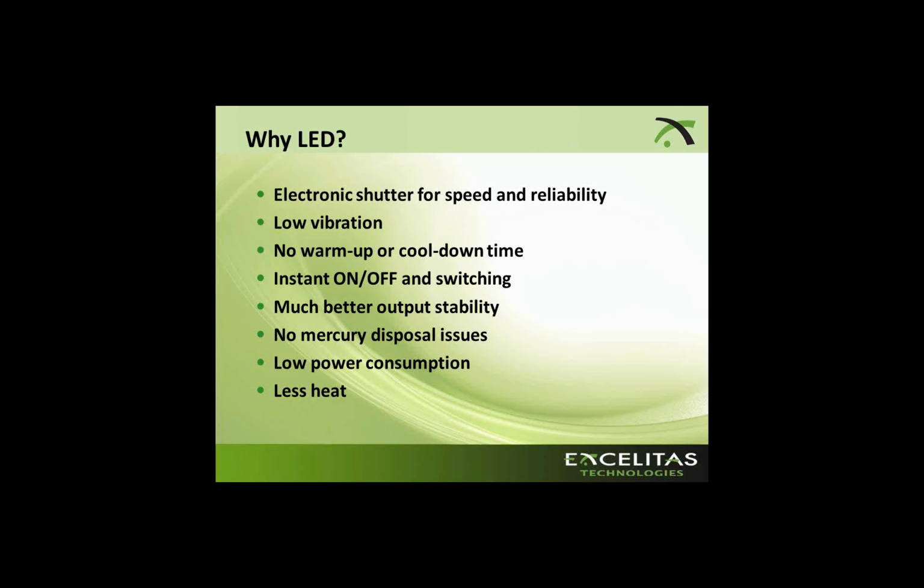They do consume less power, and they do produce less heat, but there is a caveat to that because LEDs are also prone to heat, and in fact they are more sensitive to heat than lamps are. So even though they are cooler, they are more sensitive to heat than lamps are, because if the LED gets too hot, it will affect the output, it will affect the stability, and it will affect the lifetime.